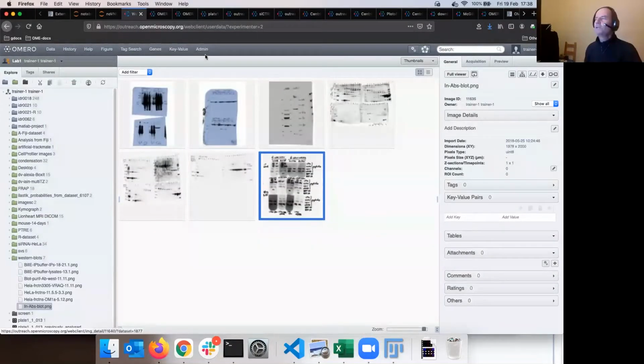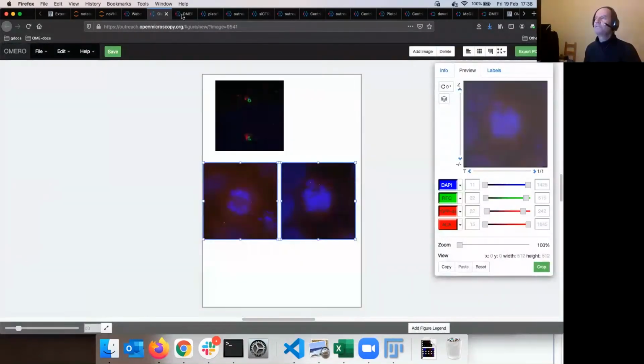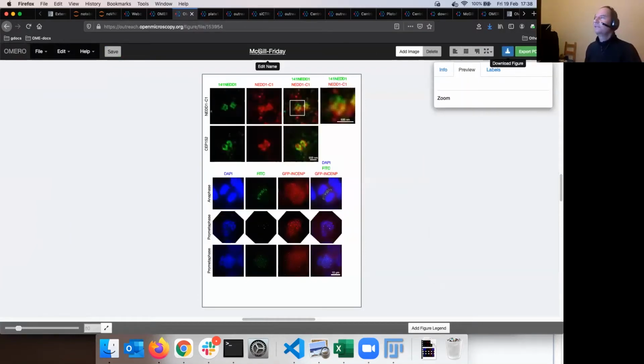There is one more feature, which is about creating new images in OMERO. What was very often requested and what we might find handy is, if we want to make a new OMERO image out of this figure, I think this is possible. If we deploy the export menu, there is a new OMERO image item. So I can go and click on new OMERO image, and something will happen, something very good.